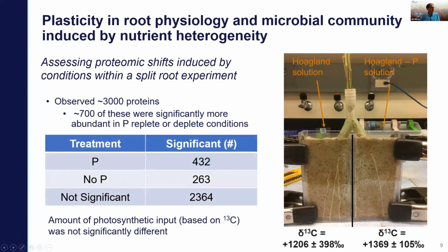So, I have quite a background in stable isotope analysis. We wanted to begin seeing if we could couple proteomics analyses with stable isotope analysis. And so this is a slightly different example. In this case, we're doing a little bit more of bulk proteomics, but we're doing it in an interesting sort of rhizobox, a little bit of a switch from what I told you before.